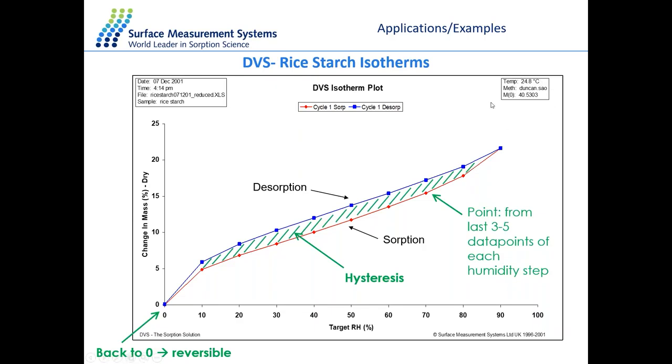This experiment was specifically run at 25 degrees C, which means that if we increase the temperature of the sample, for example, if we repeat exactly this experiment at 30 or 35 degrees C, what we will observe probably is the fact that this gap of hysteresis will reduce progressively, because we are providing more energy to the molecules of water and consequently also drying the sample much quicker.